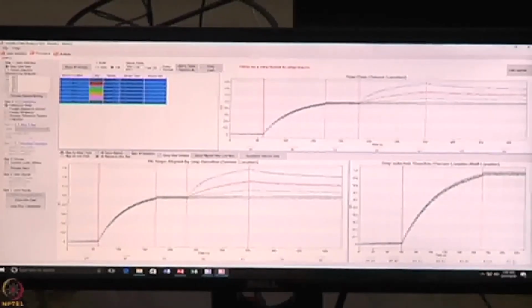prior to any experiment when you are going to set up, take a single sensor and dip into the analyte. Okay, no immobilization, nothing. When you dip the sensor into the analyte, your analyte should not interact with the sensor. It indicates that there is no non-specific binding. What happens is generally these proteins are charged species. The fiber optic is a silanol, O minus, okay. Then the protein is positively charged, so there is a tendency to attack on this glass. Then maybe you can see the binding observation. So that's why we add surfactants in that. But if you are getting a non-specific binding, you have to address that non-specific binding first, and then you have to go for the experiment.